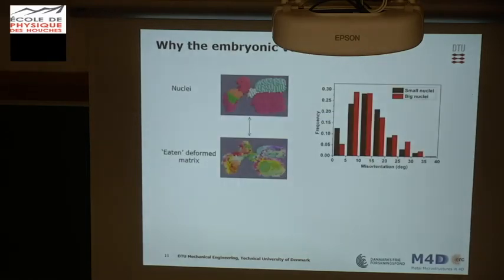And we can also analyze statistically what the boundaries are that move during the nucleation process. So here is the nucleus and its corresponding consumed volume. If we calculate the misorientation between this and this, that's equivalent to all the boundaries that move when the nucleus is growing, consuming the deformation matrix.